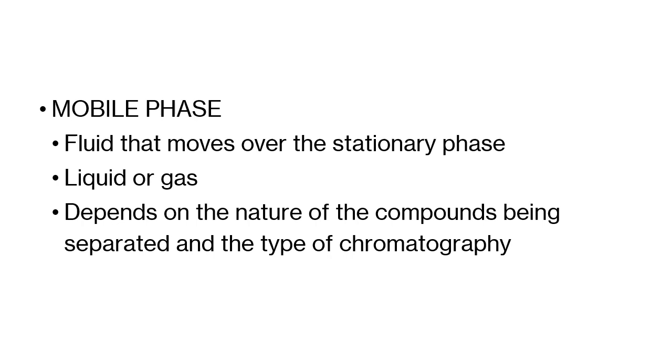It is somewhat volatile, but it's still a liquid. It's not a gas, it's a liquid: your butanol ethanoic acid mixture.